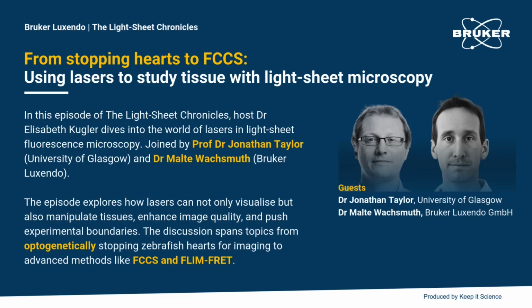Thank you so much. I think one of the really interesting things that biologists really want to know as well is how we can use lasers to manipulate tissues. Because imaging a moving heart is incredibly challenging. And I think everyone who has had a live sample under their microscope will know how challenging this is. One approach to computationally freeze the heart for 3D imaging is what is called gated imaging. That is quite commonly used in clinical imaging, such as MRI, but is significantly less used in the life sciences and preclinical models. But there was a study by Johnny and your colleagues that was published in 2019 in Nature Communications.